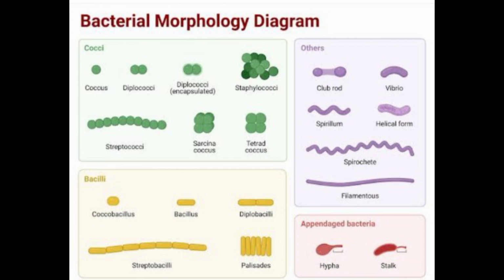The bacteria of medical importance measure 2 to 5 micrometers by 0.2 to 1.5 micrometers. The resolving power of the unaided eye is about 200 micrometers. Hence, the study of bacteria requires the use of a microscope. A microscope is used for the following purposes: magnification of an object, maximization of the resolution, and optimization of the contrast between the structure of organisms and the background.